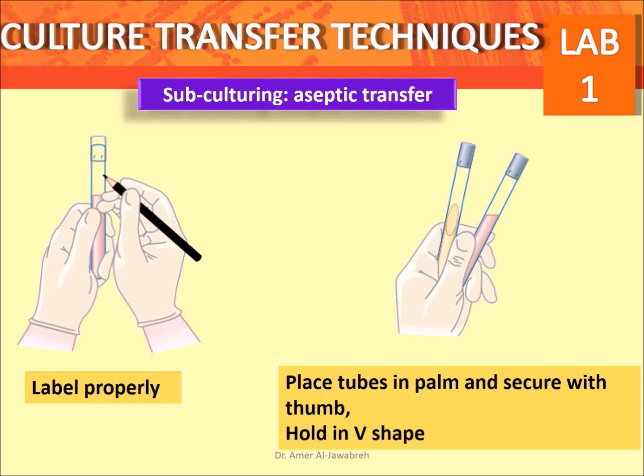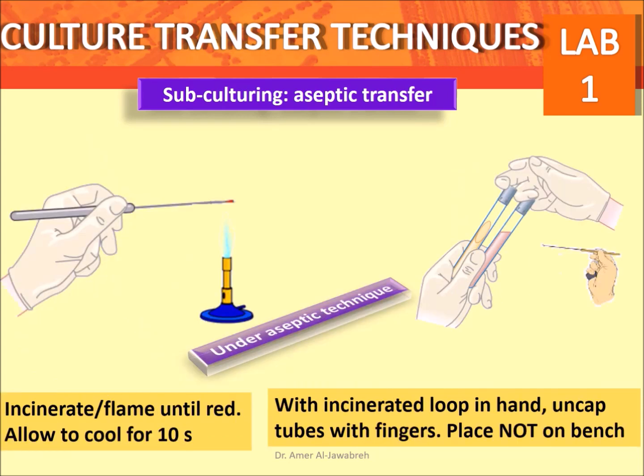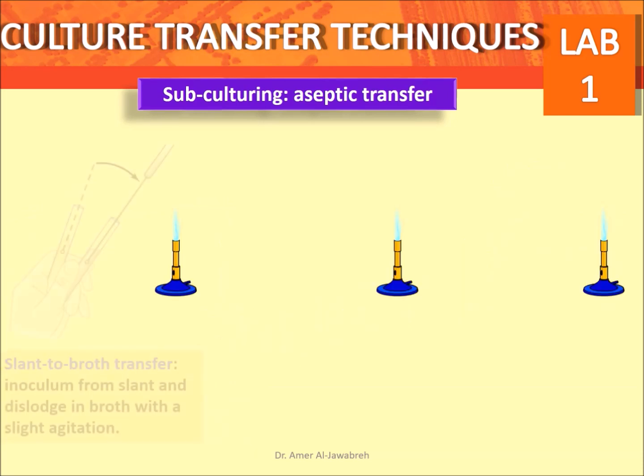Culture transfer techniques: start with labeling tubes properly, placing tubes in the palm and securing with the thumb, holding in a V-shape. Incinerate the loop until red, allow to cool for 10 seconds. With the incinerated loop in hand, uncap tubes with fingers — tubes can be held between the pinky and ring fingers, or between the pinky finger and the palm. Place caps not on the bench.